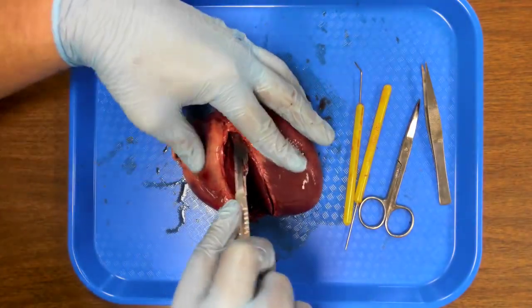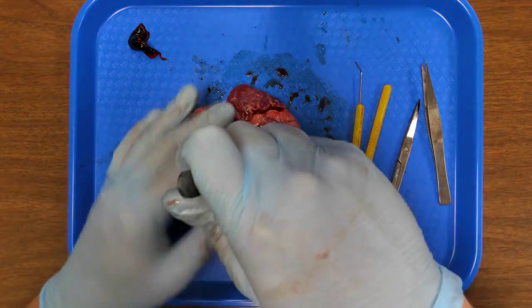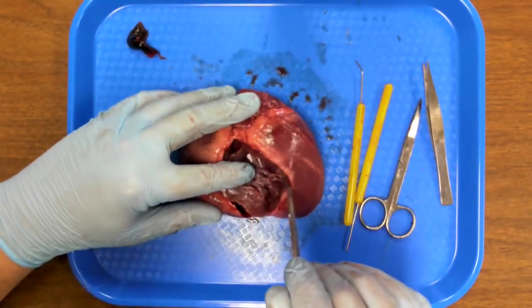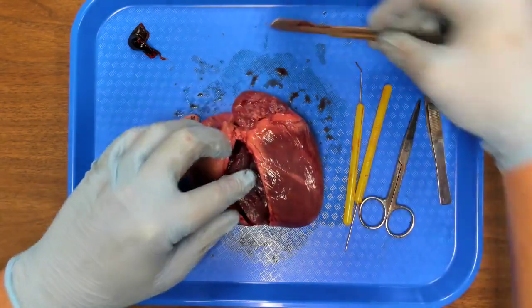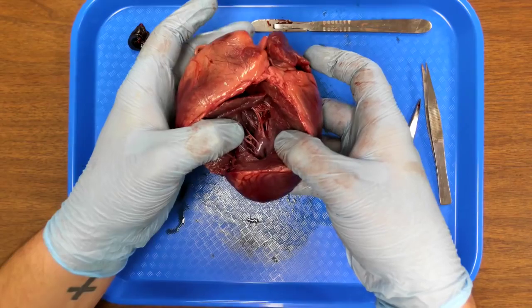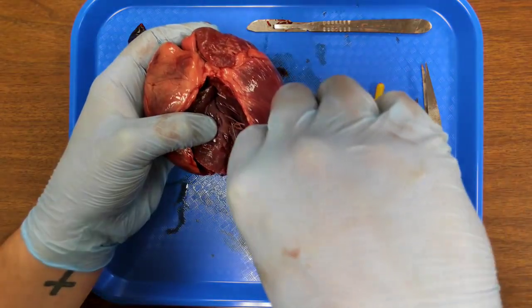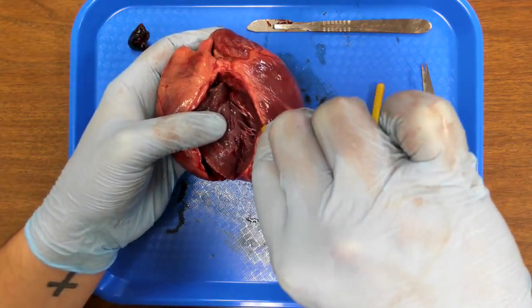Now, it looks like it's cutting pretty easy. That's because my scalpel here is very, very sharp. There we go. So now I'm inside the left ventricle, and here we see even more of those chordae tendinae, those that control all of the valves and the contractions of the heart.